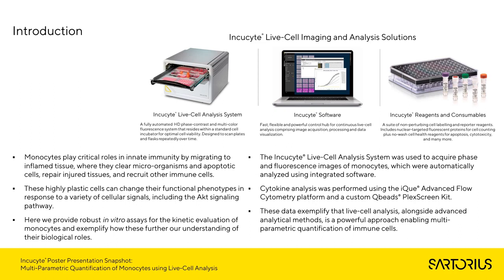These highly plastic cells can change their functional phenotypes in response to a variety of cellular signals, including the AKT signaling pathway. Here we provide robust in vitro assays for the kinetic evaluation of monocytes and exemplify how these further our understanding of their biological role.